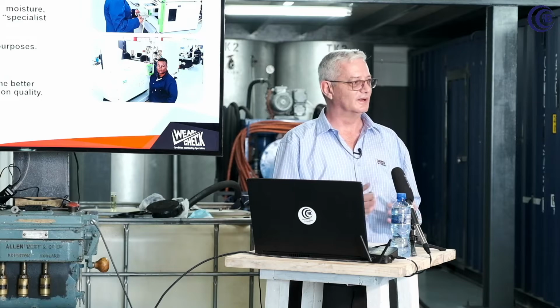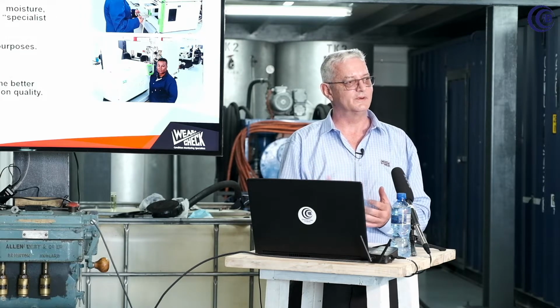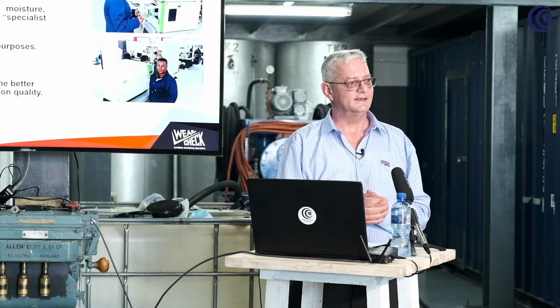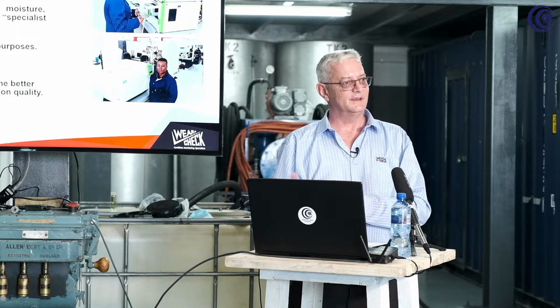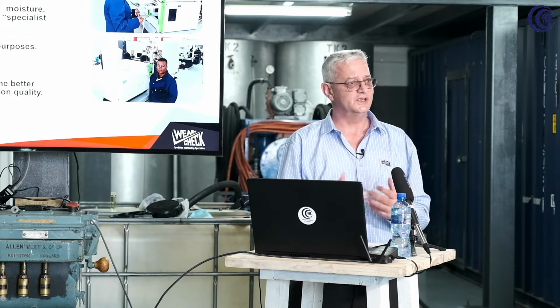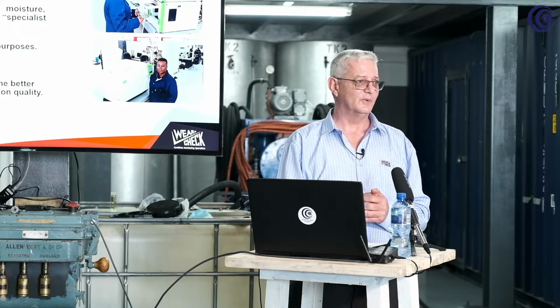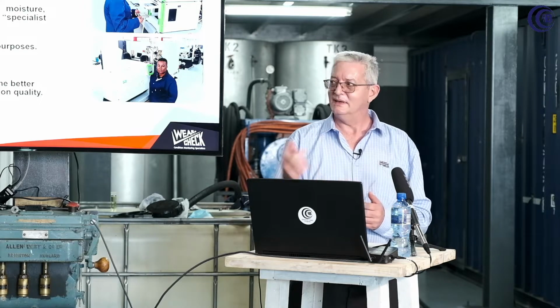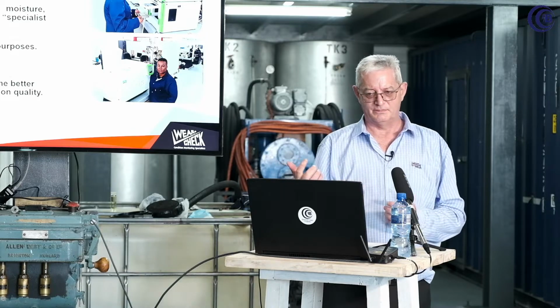So people sat down a little bit and they found that you can actually test the paper condition from your transformer oil. So nowadays, and we will look at that test, the Furanic test, you can test it out of your oil. You don't need to take a paper sample anymore. There are some conditions to that now. Everything has got good points and bad points, and we will look at those. But we can test it now out of your oil. We don't need the actual paper sample to do a test for you.